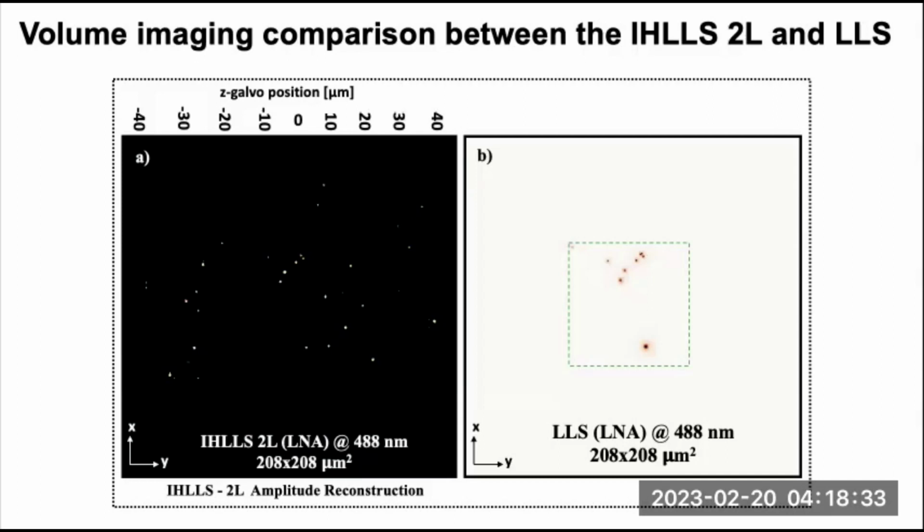We observe that ILS2L performs better in comparison to the conventional lattice light-sheet system in detecting regarding the scanning detection area. The scanned area with detected beads in the ILS2L system with lower numerical aperture is the full field of view of the CMOS detector, while the scanned area with detected beads in a lattice light-sheet system with lower numerical aperture is about 78 by 78 micrometers squared.